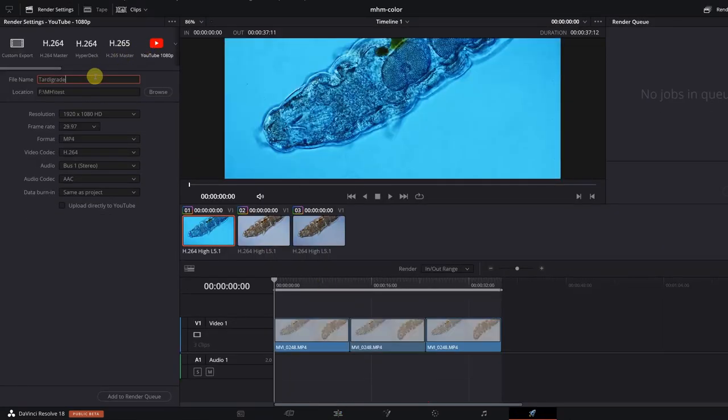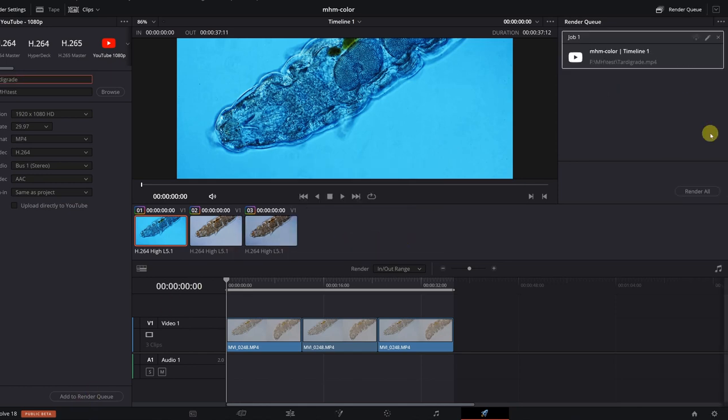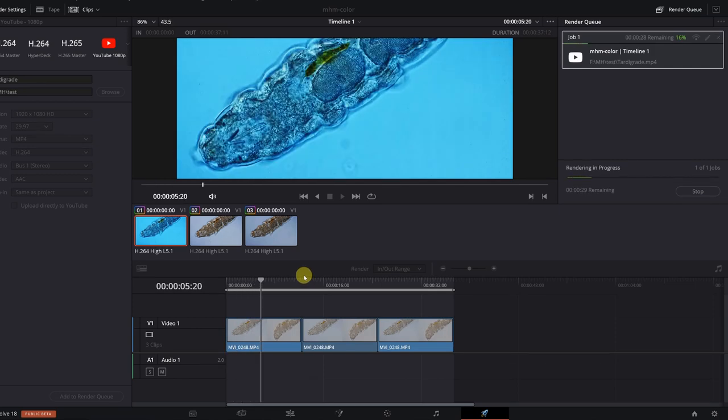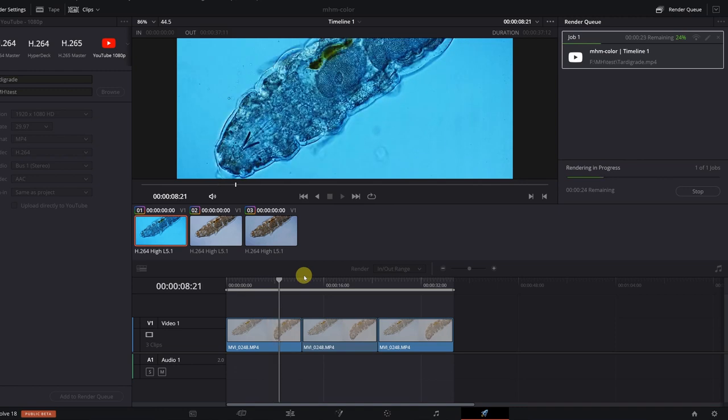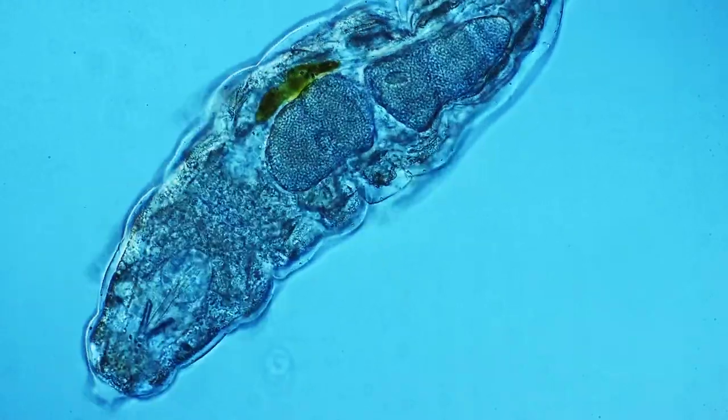In order to export them, of course I have to type in a new file name, and I'm going to click render. I'm going to replace the file and click render, and I have to wait a few minutes. Then I have my finished MP4 file. Now let's have a look at it and how it looks. That is the one with the bluish background.